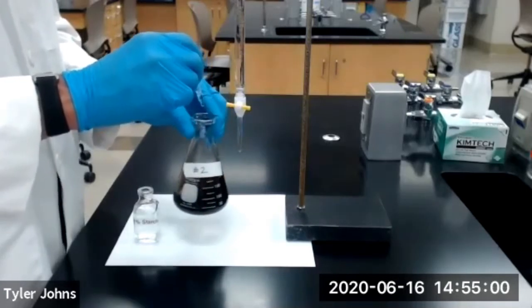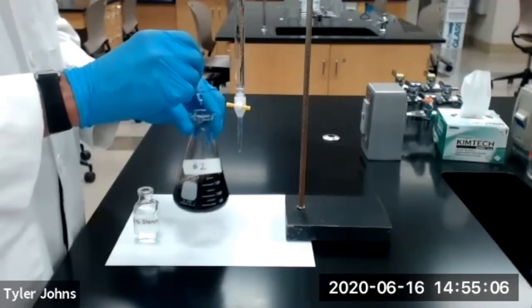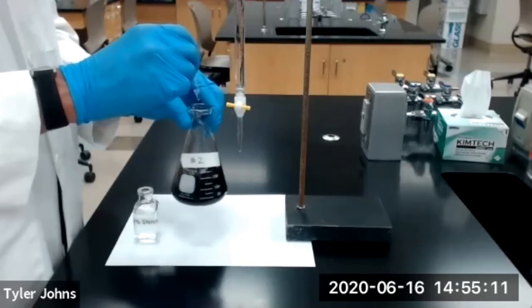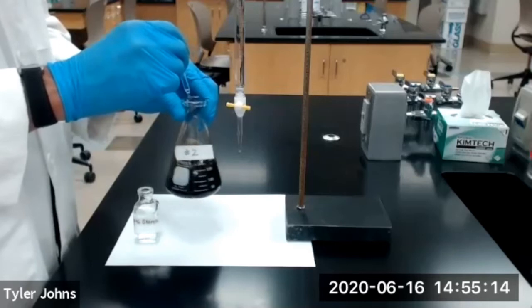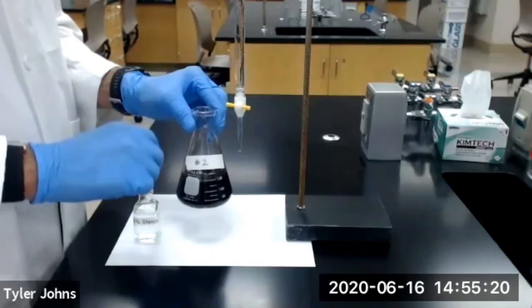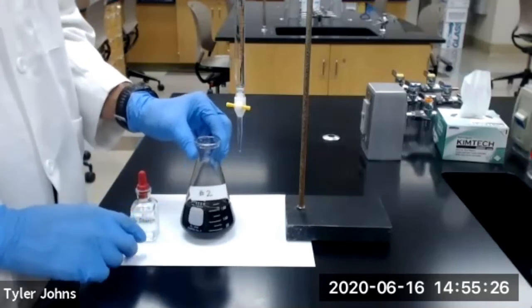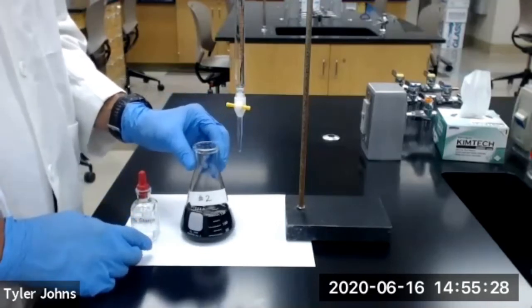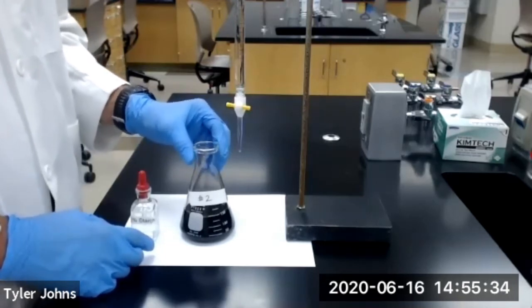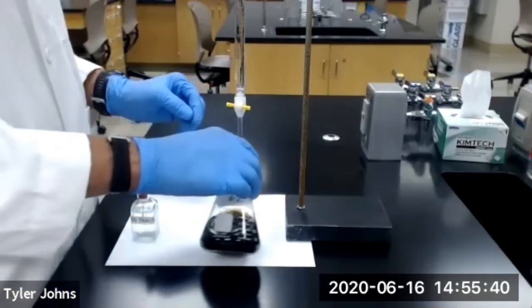Note that our color is starting to change, but we want to get to the point that we have a dark blue color. We now have our dark blue color, so we're going to continue the titration, adding sodium thiosulfate solution from the burette until the endpoint. The endpoint for this titration again is just until the blue color disappears.